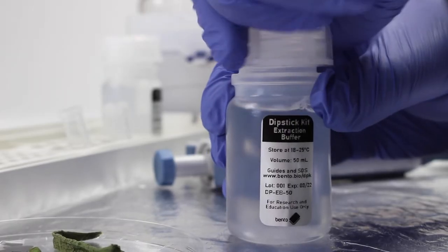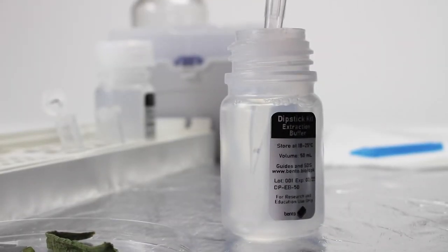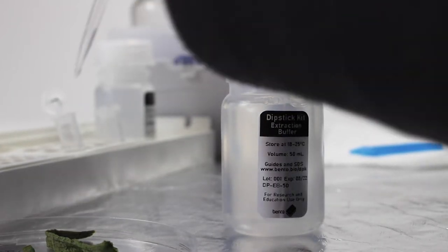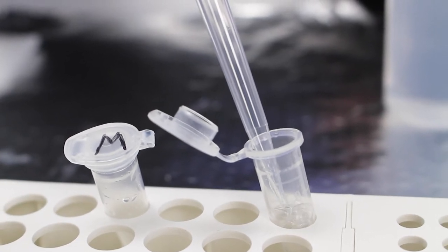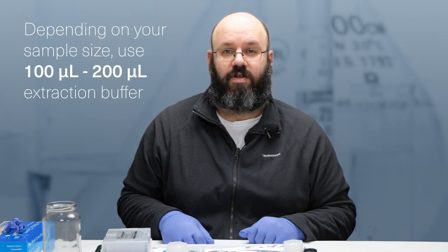The first step of the dipstick method is a cell lysis step using the extraction buffer. The buffer contains a dilute ionic detergent and salt. Aliquot a small amount of extraction buffer into the first 1.5 mm tube. The exact amount depends on the size of your sample, but it's generally around 100 microliters to 200 microliters.